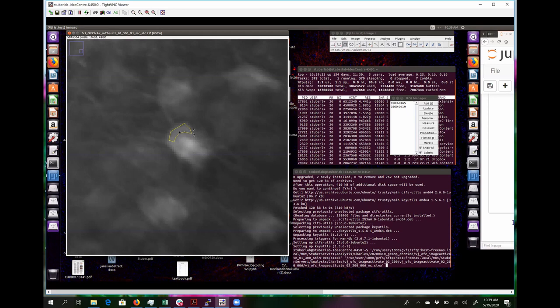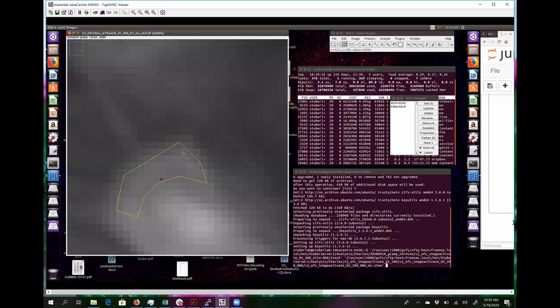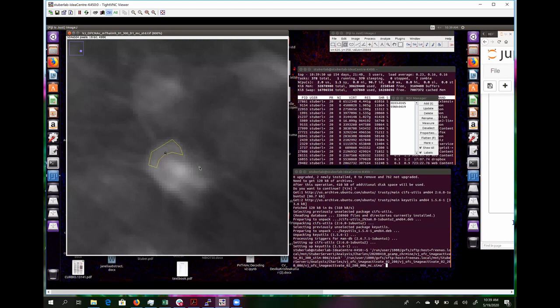So now the number of pixels here is probably about 10 to 15, or maybe even more than that. I think I've zoomed in, so let's start counting: 1, 2, 3, 4, 5. So yeah, there's more than 20 here. Easily 20. So that's more than enough pixels that you can average to get non-noisy outputs.